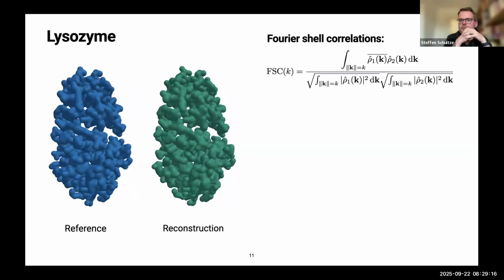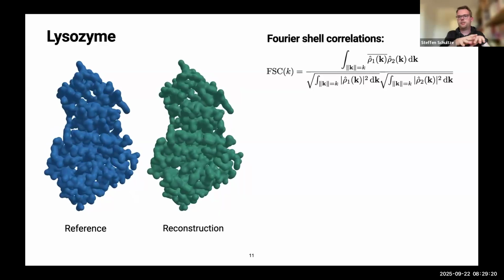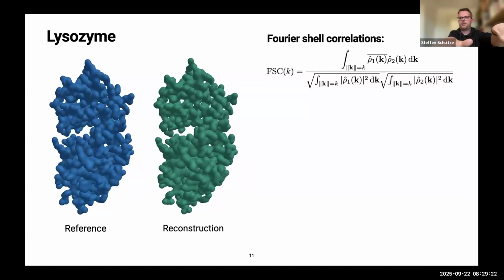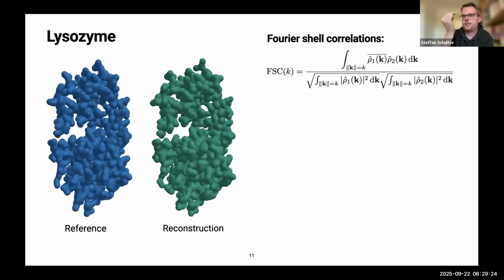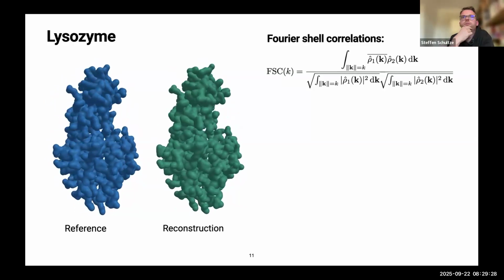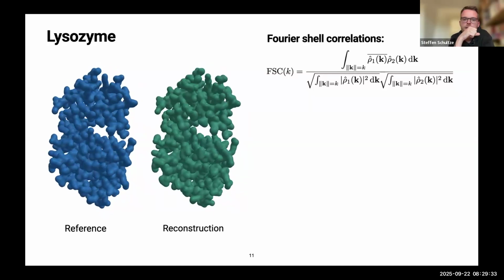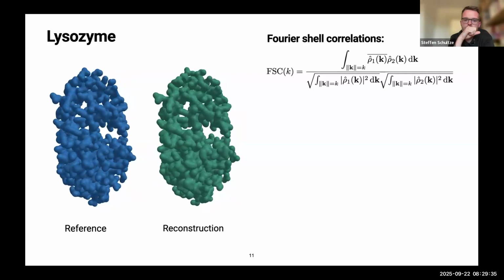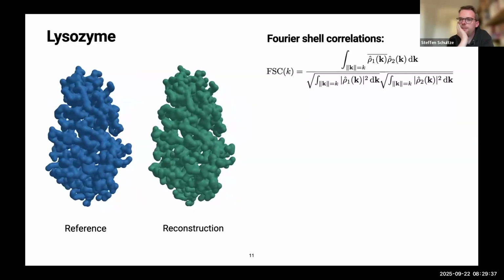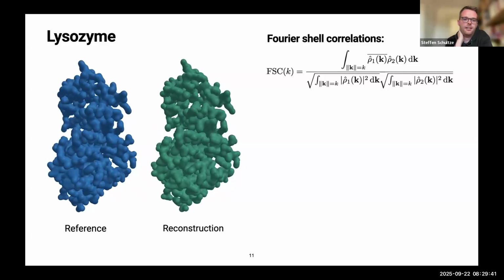More recently, they have gone to liquid sheet injection, where you have a nozzle that spreads out a very thin film of liquid, micrometer thick. And that should really give you pretty good, actually, in-solution scattering then. Sorry, what was the other question? Oh, why one cannot increase the photon count? Yeah.